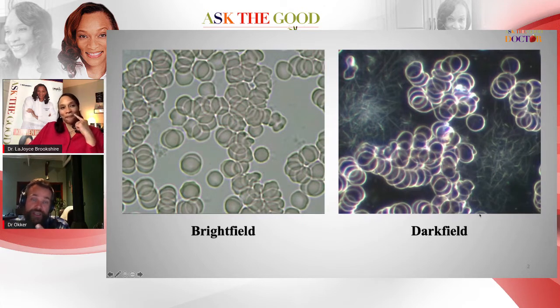But various things in your diet and lifestyle can cause the cells to start sticking together, and that's the real benefit with live blood analysis, that a lot of what we see in blood samples may actually be self-inflicted by clients, simply through incorrect dietary and lifestyle choices. So it's a very useful tool to educate people, to show them the actual effects of what they're putting in their bodies. Yes. And is this kind of clumping the one that's called rouleau?